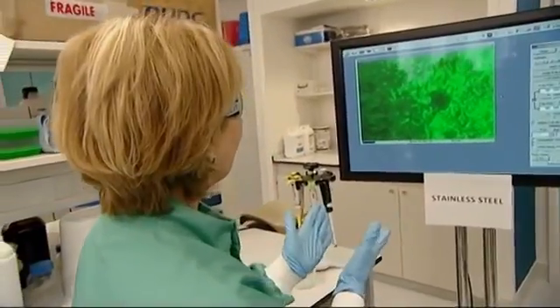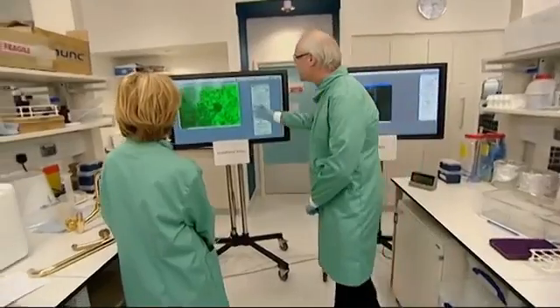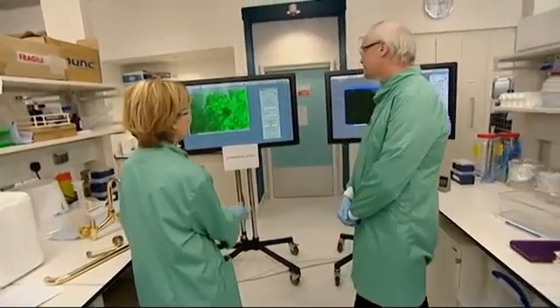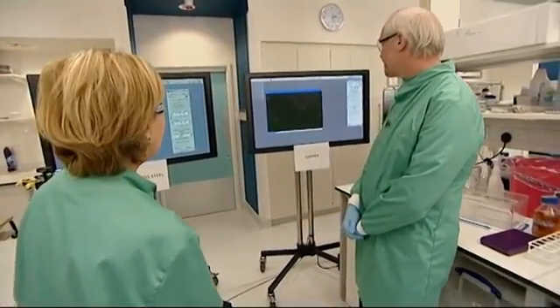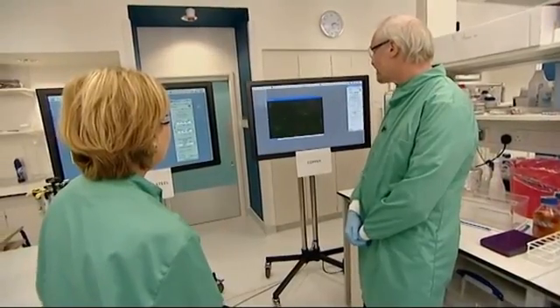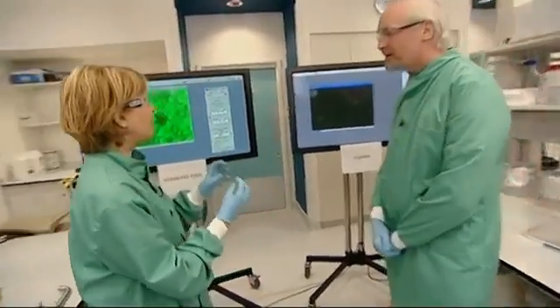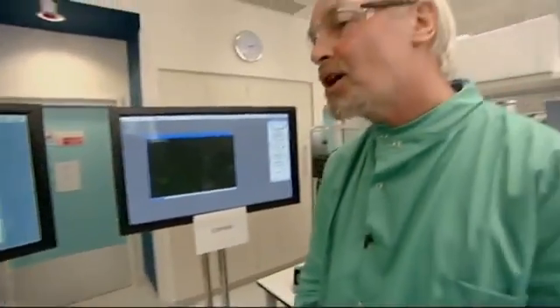So we're now coming up to 6 minutes into the experiment, and let's have a look at our screens again. So, stainless steel, Professor Keevil, a lot of microbes there. Yes, you can see they're still as bright as at the start of the experiment. And now copper? On this one you can see they're even paler, so very few cells surviving now on the copper surface, even though we put 10 million on there to start with. Now, what is the scientific process that's happening here? How are these bugs being killed off? Well, we're starting to understand that copper works by multiple means, and it shuts down the cell's biochemistry and physiology.